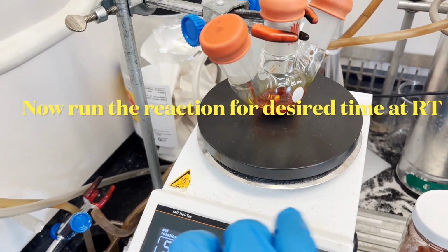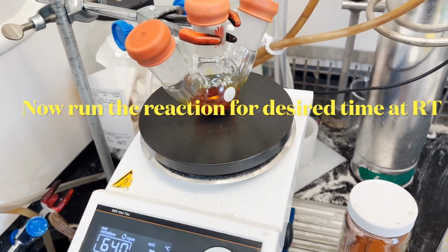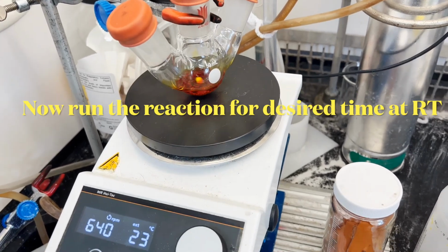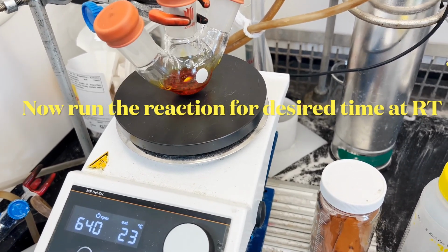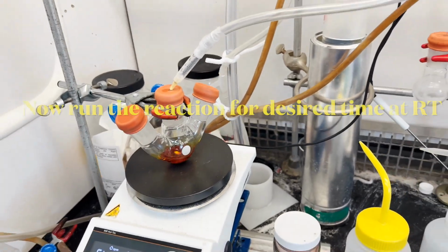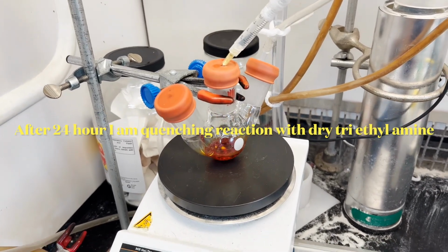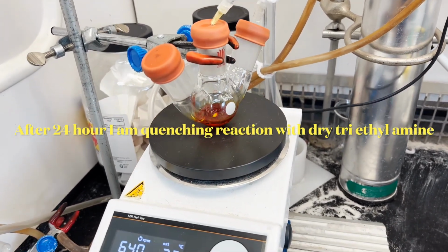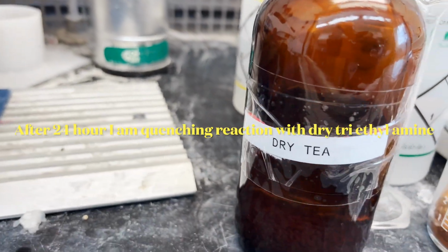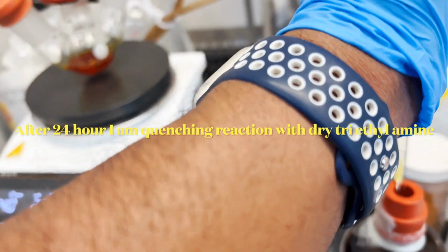So I'm stirring the reaction system at room temperature. As I mentioned, you can stir it for the desired time at room temperature, but I'm going to stir it for 24 hours. Okay, after 24 hours of reaction time, I'm quenching the reaction with dry triethylamine, or anhydrous triethylamine.